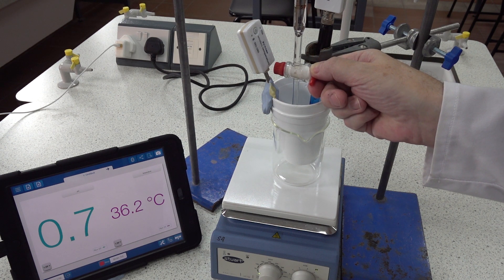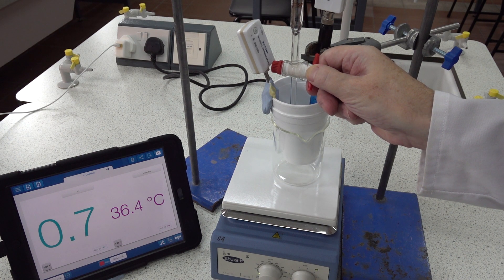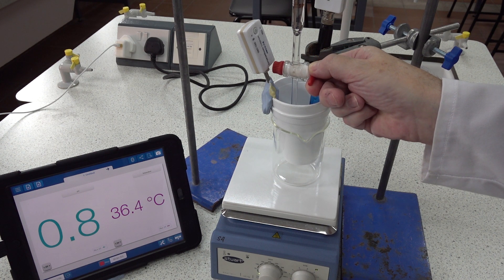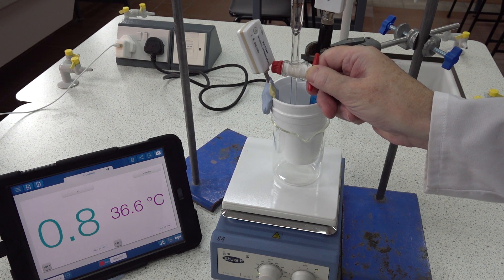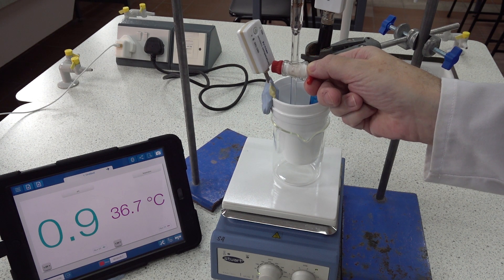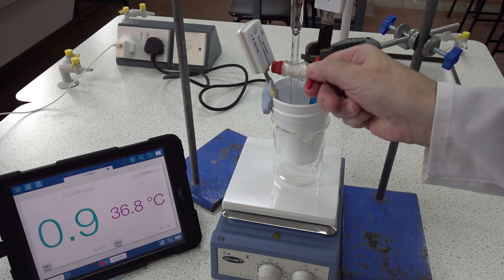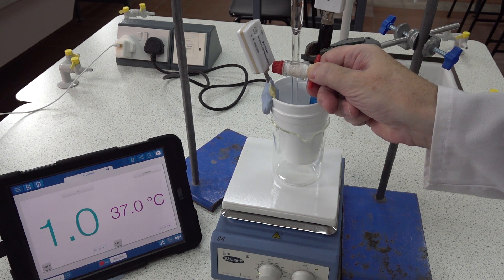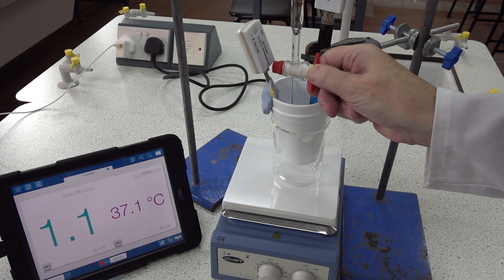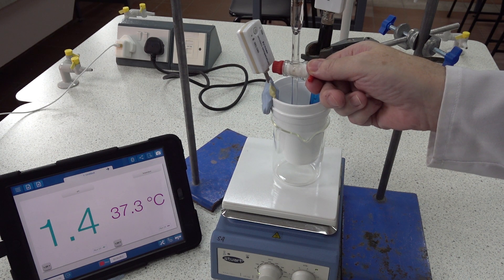Twenty-one centimeters cubed. Twenty-two. Twenty-three. Twenty-four. Twenty-five — there's some movement in the pH.